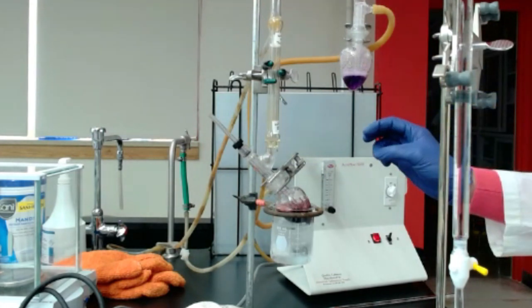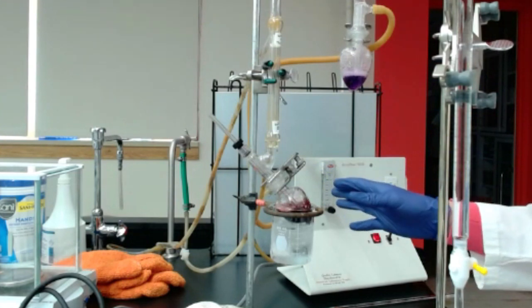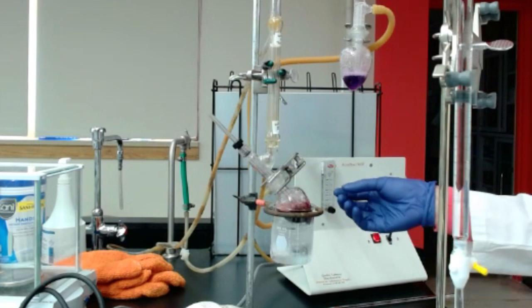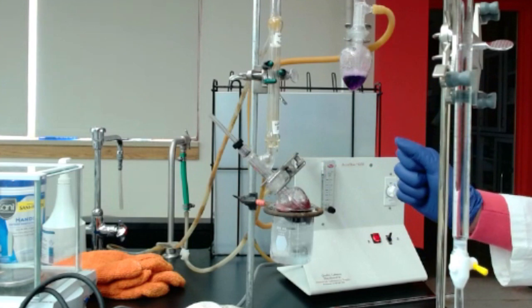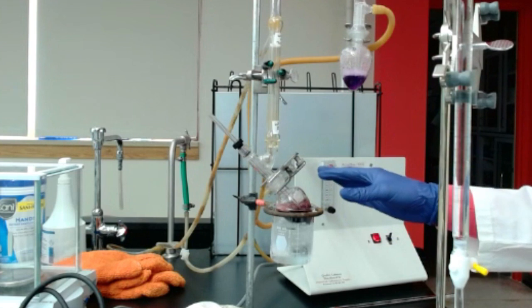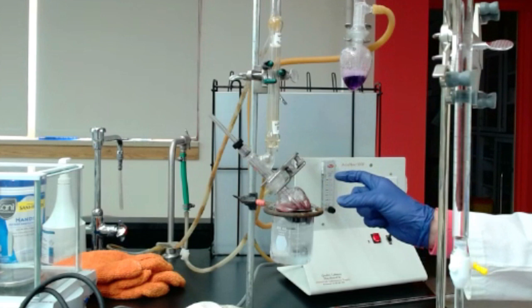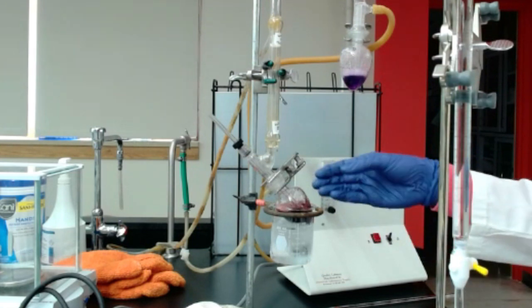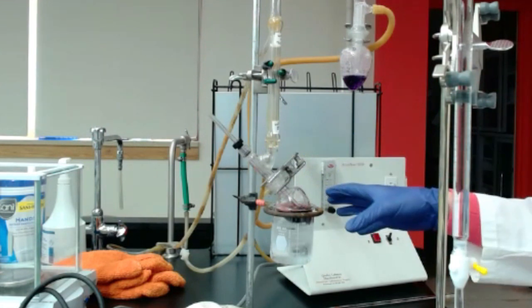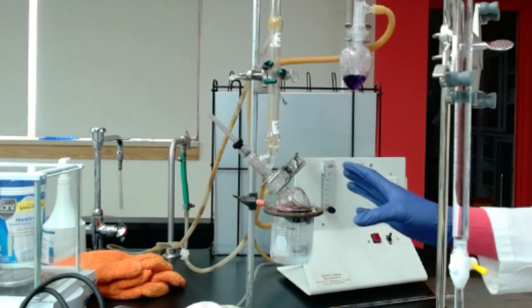Another thing is about the anthocyanins. Red wines are rich in anthocyanins because they are the red pigments, and those are forming bonds with the sulfur dioxide, but those bonds are pretty weak. And so you might have an overestimation of free SO2 because of those weak bonds that are pretty easy to break. The release of SO2 can also come from those bound SO2 with anthocyanins. So that's one thing to really know.